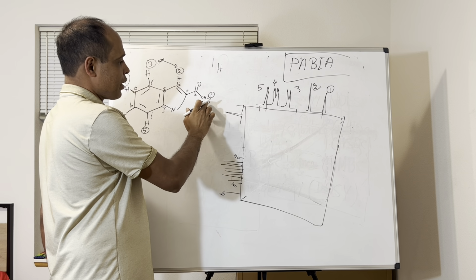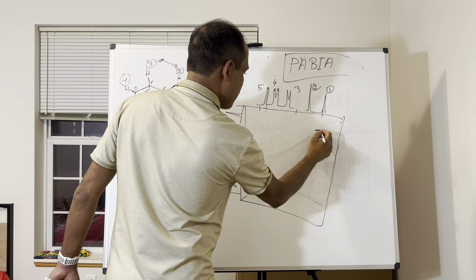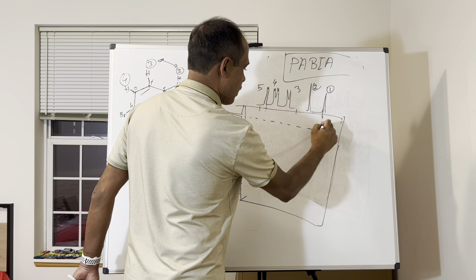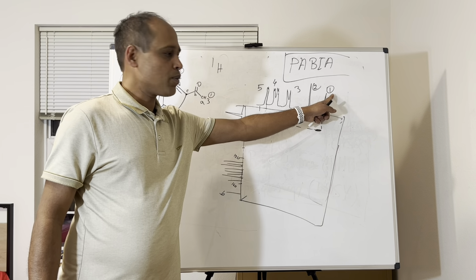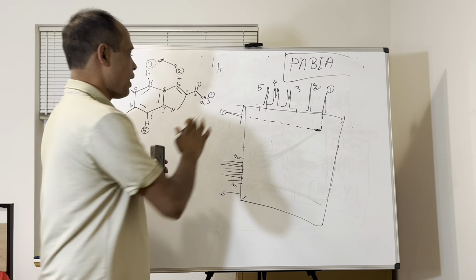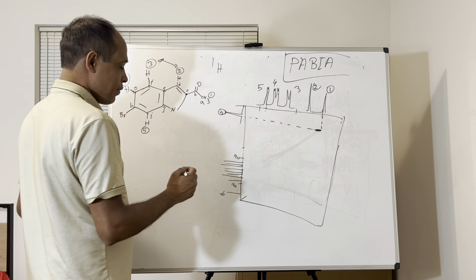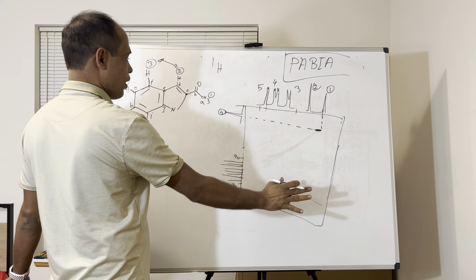Which proton? CH3 as a singlet. So you will see kind of this. That means you can easily draw a line, connect it, and see that this number 1 type of proton is connected with the A carbon. That's the HSQC.